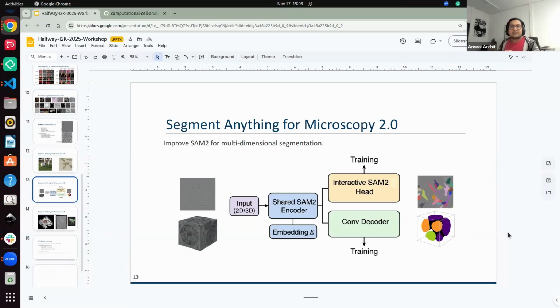Now, what we want to do with Microsam 2 is get away from this and do universal segmentation, wherein the same model pre-trained by us will allow accepting 2D images or 3D images. For 2D images, it would process exactly as a 2D image. For 3D images, it will take the spatial context in the learning heuristics and give you a segmentation output. This is kind of the high level goal we are trying to achieve over here.